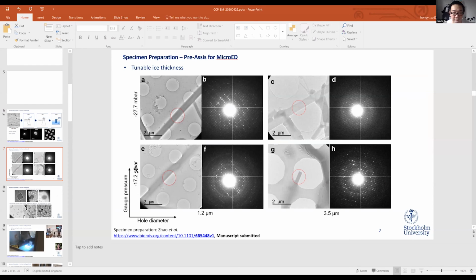We tried this after Tamir Gonen's group published this fragmentation method, but it wasn't very successful. At the moment, for crushing crystals, we can use ultrasonication for a very short amount of time. We can use beads, like a seeding procedure.